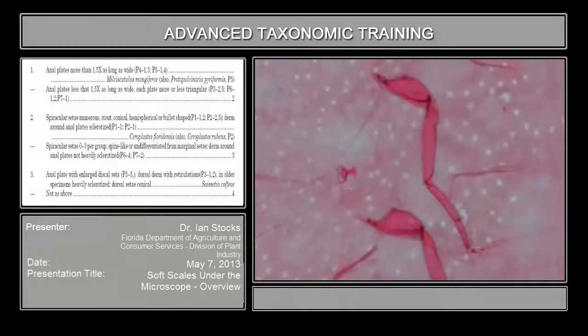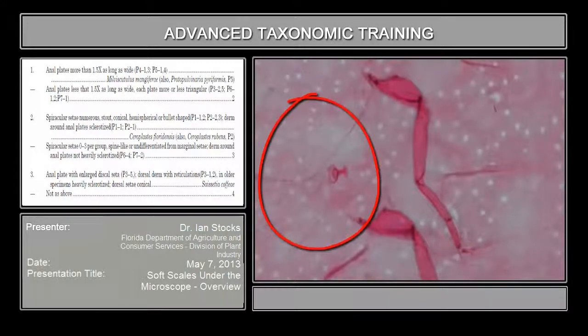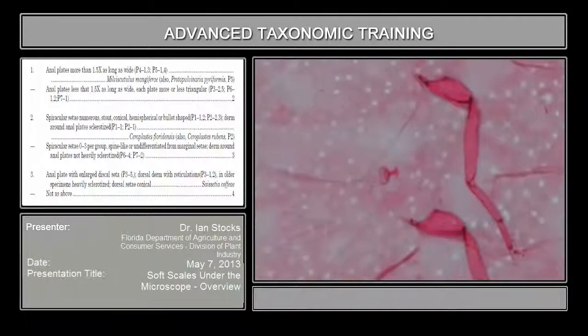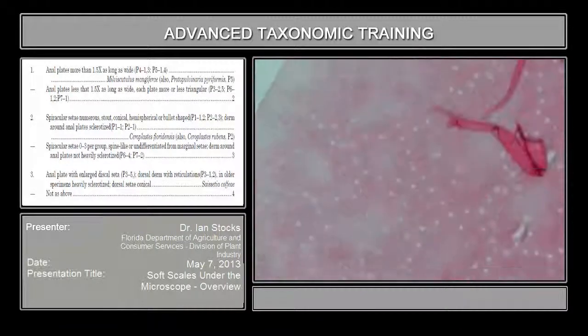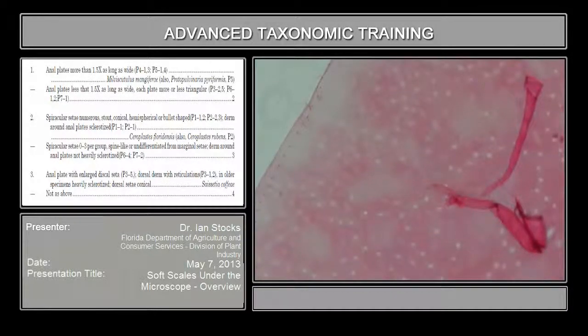Depending on how the specimen is mounted, you may see tubes sort of coming off from around this area all throughout the body. Very often those things come out of the specimen during processing, but at least for some species they do remain. Those are the tracheae that go throughout the body. They branch out gradually as they get further and further away. The other thing about the spiracles, let me go back to the anterior one. It's a bit more clear in this specimen here.